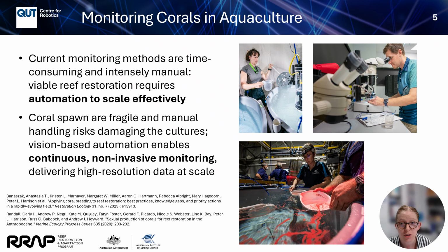Current spawn monitoring methods are extremely manual. Here we can see scientists extracting samples and then counting them under a microscope. The spawn is also incredibly fragile, so every time it is removed from the tank for counting, it can be damaged.